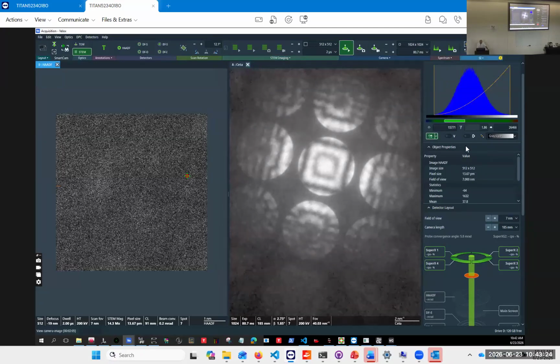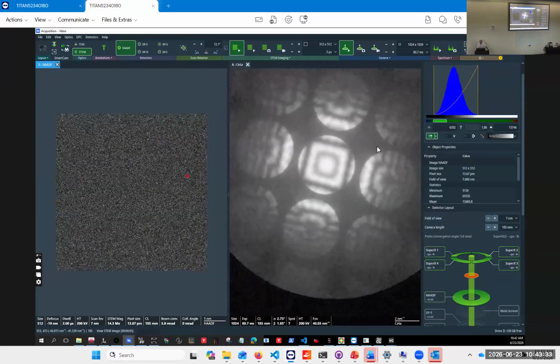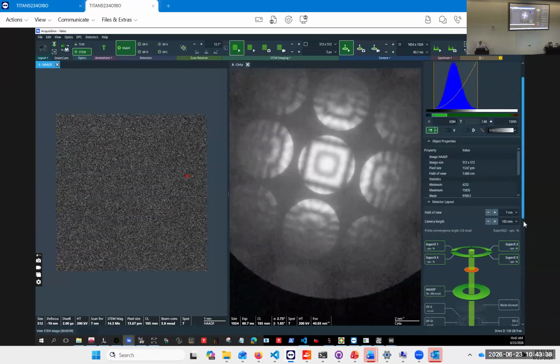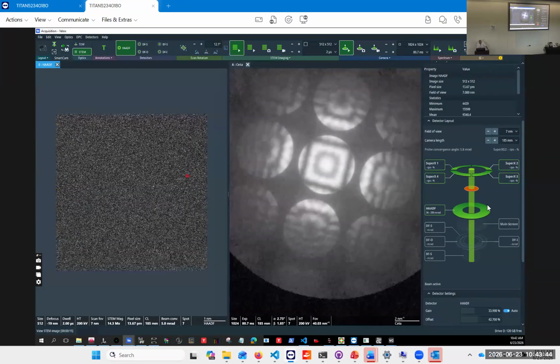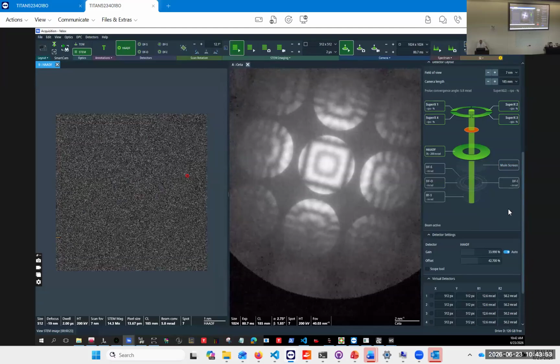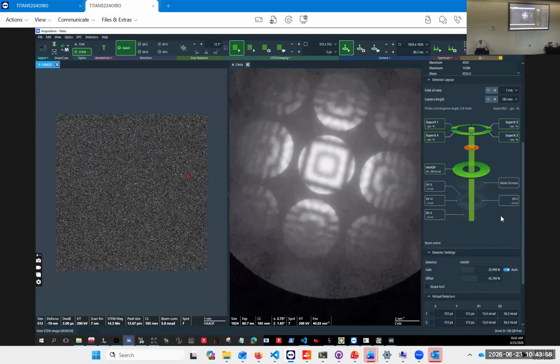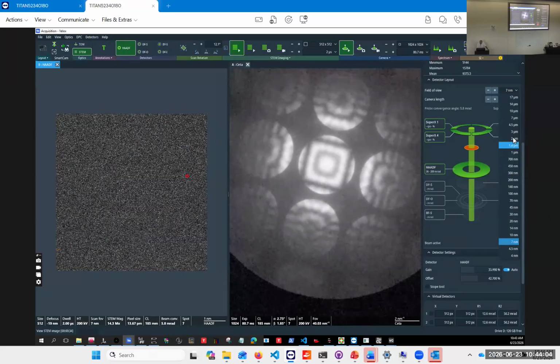We don't have a high-angle dark field detector in right now. So the problem is that we are not having a good image here probably because of our inner angle. So that's why I didn't want to change that. Yeah. We could also tilt the beam. My beam tilt is not easily available. It's only available through the remote control.